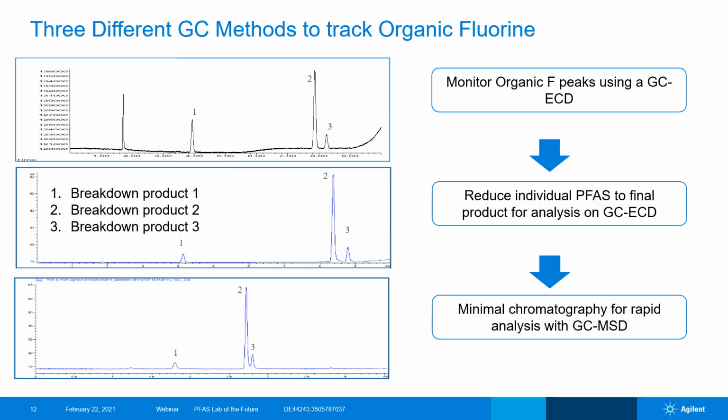So the first thing I wanted to talk about was this surrogate or indicator analysis of PFAS compounds, right? So the goal really here is not to identify specific PFAS, but is actually to identify whether there is potential PFAS contamination in these samples, and if so, do they require individual identification of PFAS. So the critical aspects of the surrogate and indicator tests is that they must be rapid to perform, have really quick turnaround times, and be able to do with an easy and less expensive workflow and instrumentation.